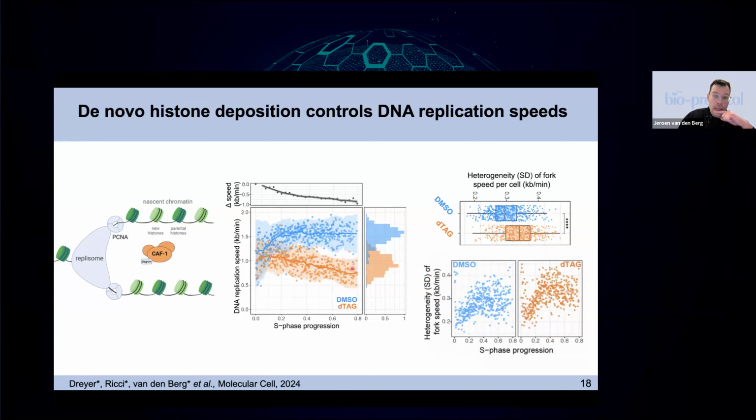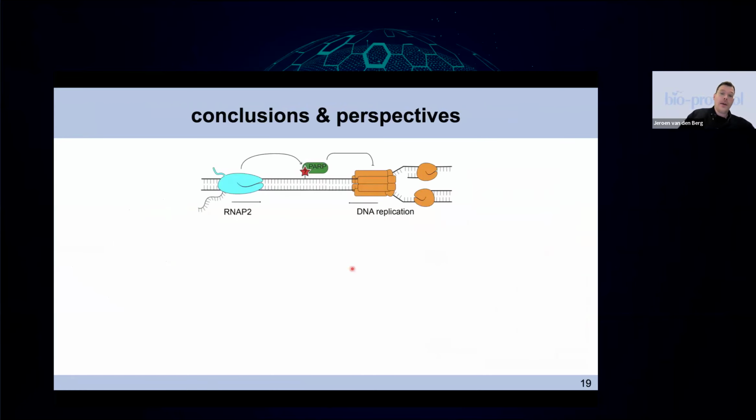So to wrap up, what we're interested in and what we tried to describe in our initial publication using single-cell EdU-seq was how RNA polymerase does transcription, how this affects obstacles, so creates DNA damage, which recruits these PARP enzymes, which now represses the DNA replication machinery from progressing.